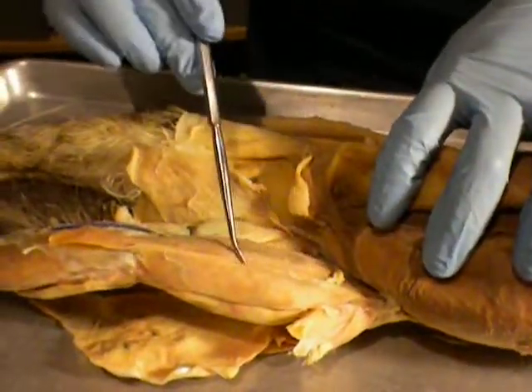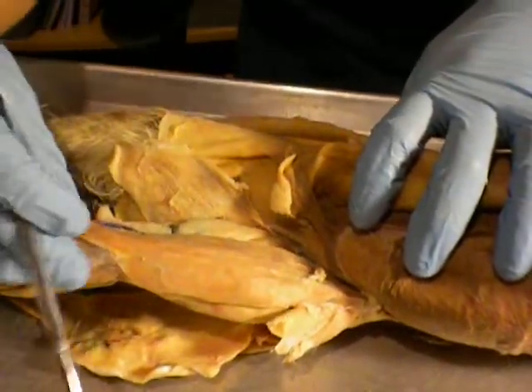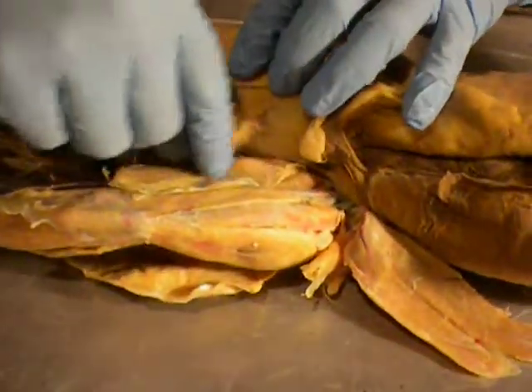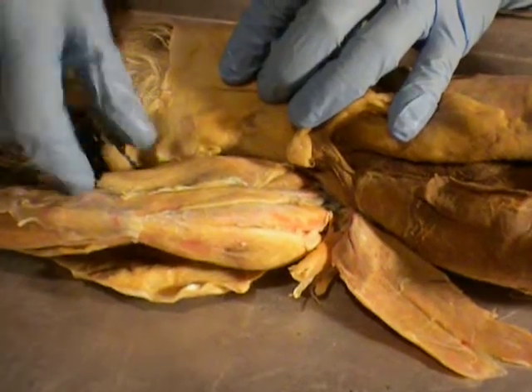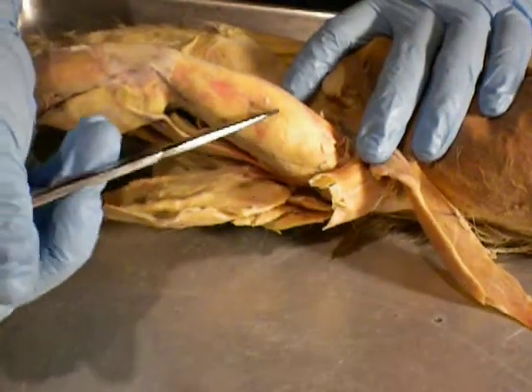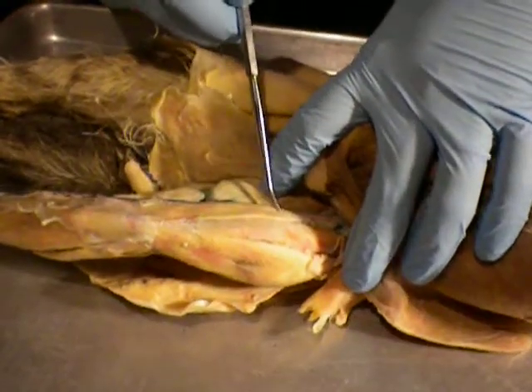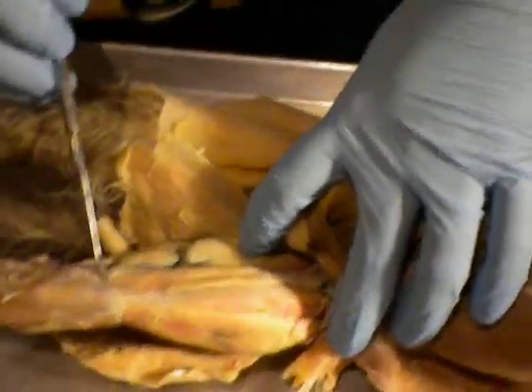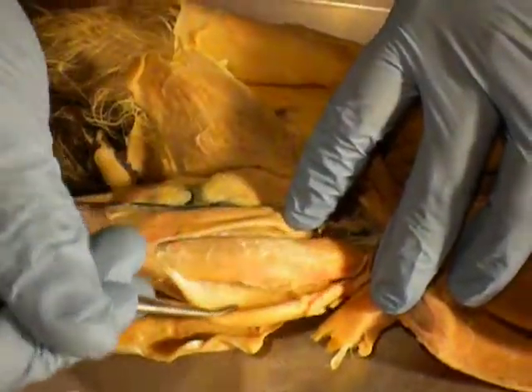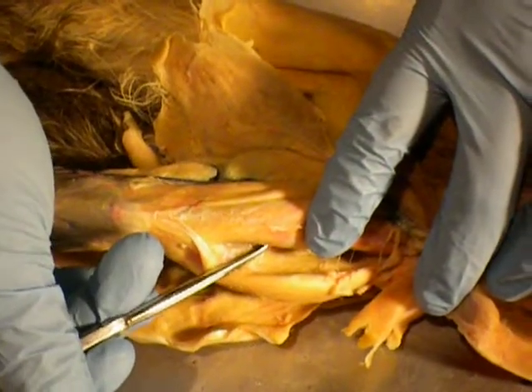This is the sartorius, this thin muscle that covers almost all of the thigh group. You pull that back. This is the gracilis, which is also a thin muscle that covers the interior portion of the thigh group. Expose that. This is the vastus lateralis, vastus medialis, the interior portion. Rectus femoris here in the middle, and underneath the rectus femoris is the vastus intermedialis. Intermediate, think middle.